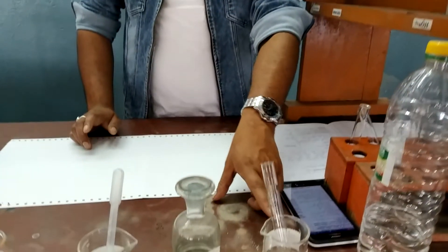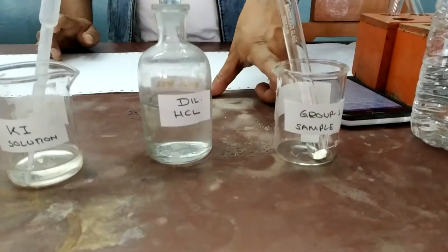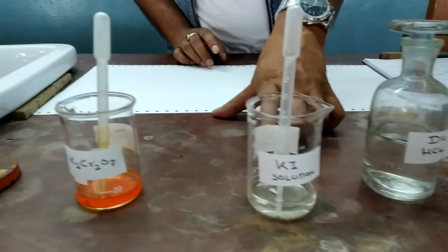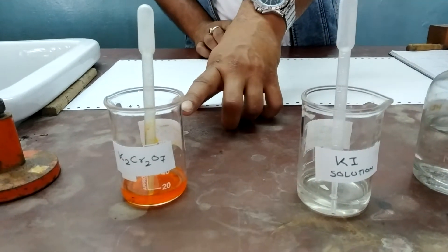For that we require a sample, dilute HCl, potassium iodide solution and potassium dichromate solution.